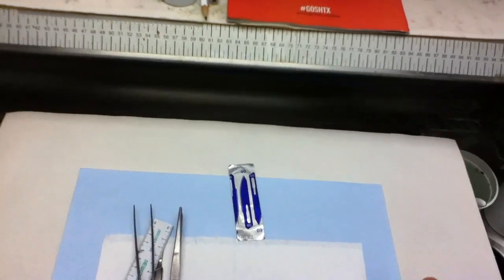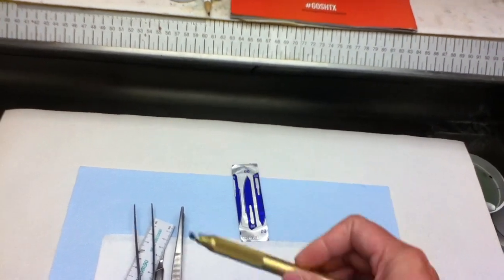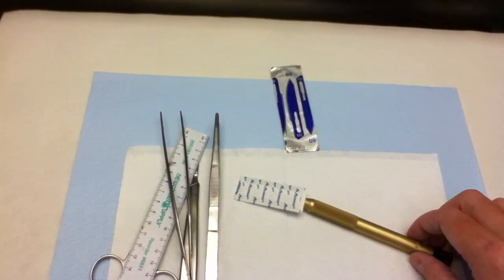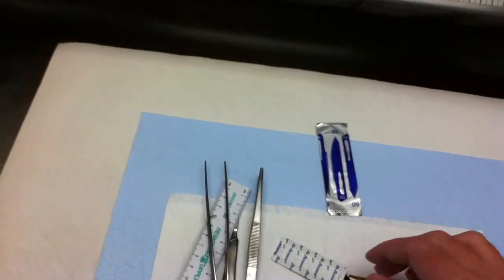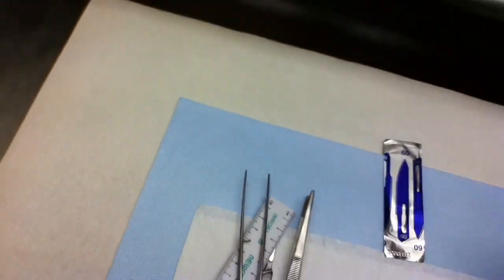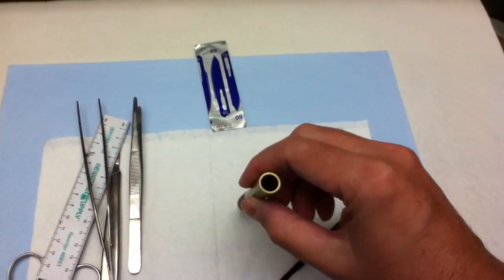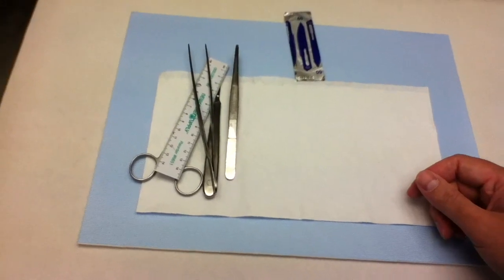This is a Pathco blade holder — it holds a double-sided razor blade and it's a bit bigger than a regular scalpel. What I like about it is you have a blade on both sides, which can be dangerous but the blade holds up well and is easy to change out. The only thing I don't like is it's difficult to clean — junk gets into the tube and you have to rinse it out. I use it occasionally for having an extra blade at the bay.